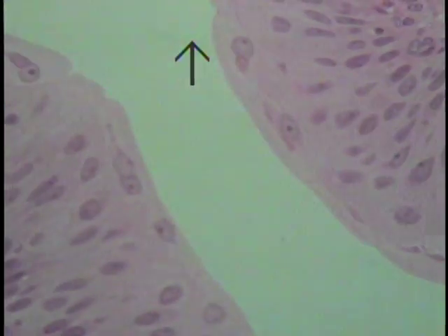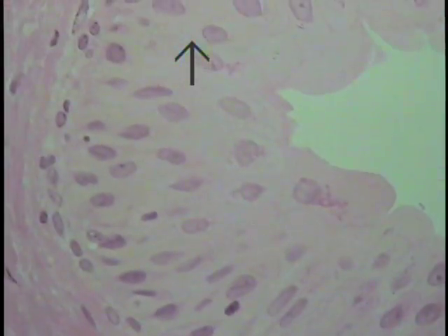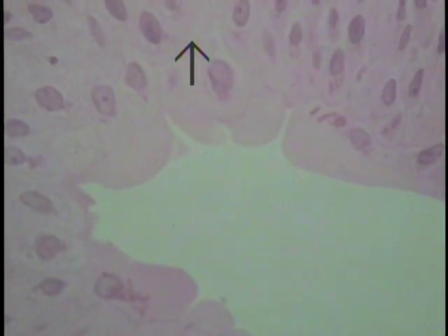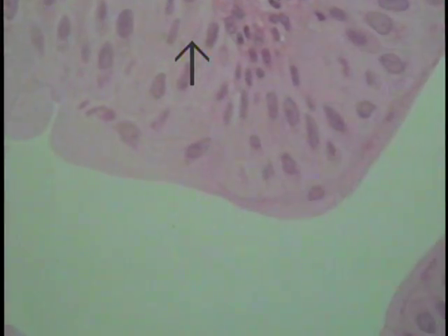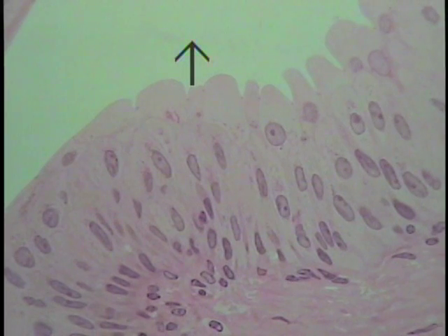As one courses along, you can see these dome-shaped cells a little bit better at increased magnification, and how they bulge out into the lumen and give a sort of scalloped interior to this luminal surface. So this is transitional type of epithelium, so named because it can accommodate to the volume or fluid placed or the pressures placed on this particular epithelium.